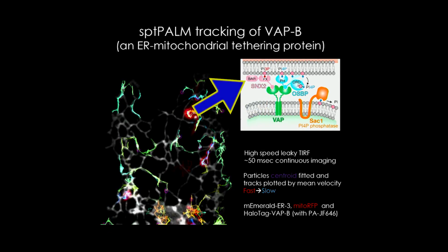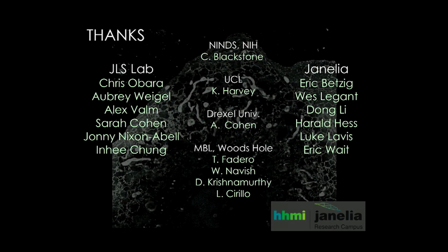So with that, I want to end and say that this field is really being significantly impacted by the high-resolution technology that's now available, that scans from electron microscopy up to the fast imaging technology. People in my lab have been greatly impacted by the physicists at Janelia, Eric Betzig and Harald in particular, who've really provided the technology that allows us to do this type of work.